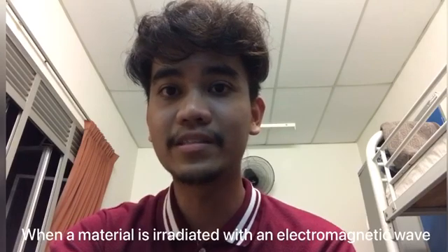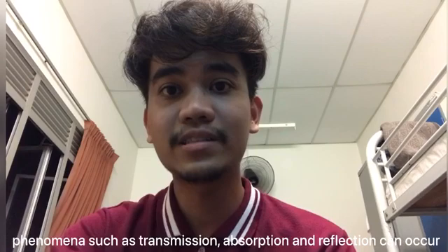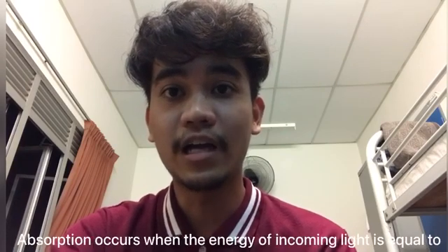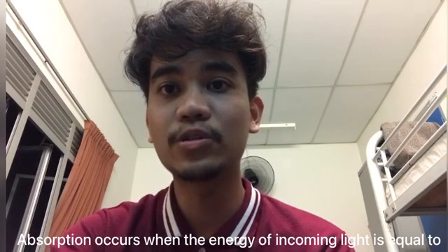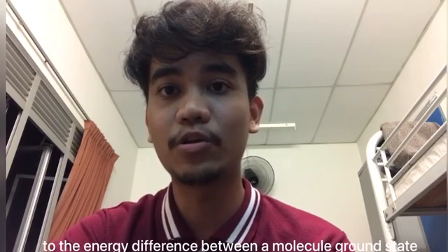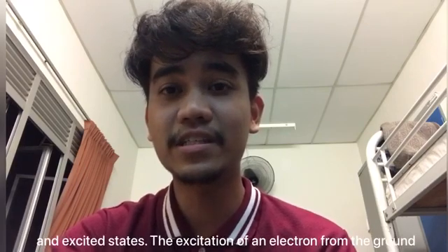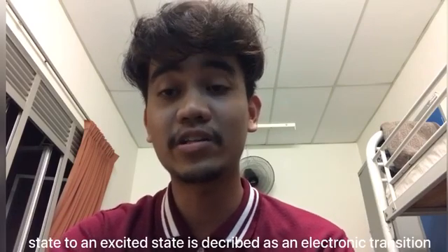When a material is irradiated with an electromagnetic wave, phenomena such as transmission, absorption and reflection can occur. Absorption occurs when the energy of incoming light is equal to the energy difference between a molecule's ground state and excited state. The excitation of an electron from the ground state to excited state is described as an electronic transition.